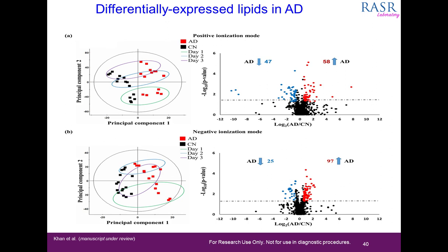So we took a small subset of lipid samples from Mustafa's plasma cohort: just 5 cognitively normal individuals and 5 AD individuals, and we subjected them to reproducibility experiments that we ran on 3 different days. These are not batch corrected, so that you can see the differences between the batches. What you see from the PCA plots is that we can distinguish the cognitively normal individuals from the diseased individuals very clearly. You can also see that there are differences between the days, and those are being normalized.